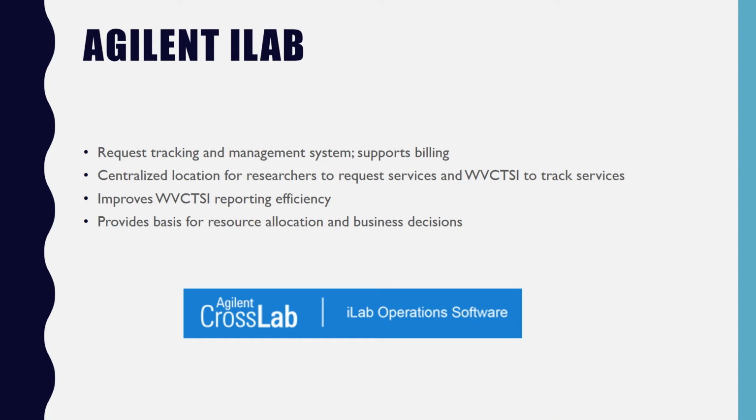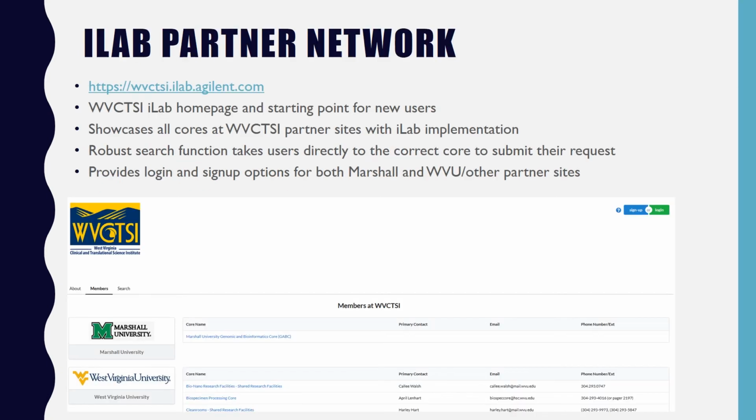iLab operations software is a product of Agilent. It's a request tracking and management system that also supports billing. WVCTSI uses iLab as a centralized location for researchers to request services and WVCTSI to track the services that we've provided. This improves the WVCTSI reporting efficiency, and it also provides the basis for resource allocation and business decisions.